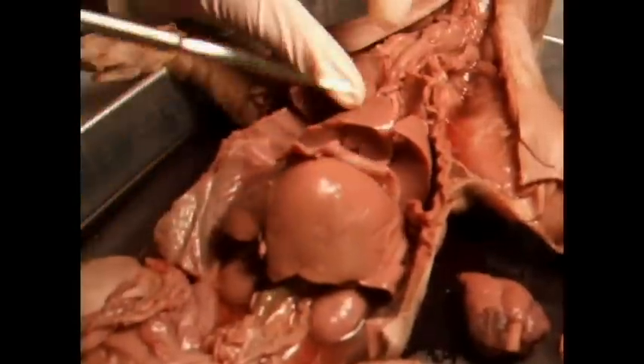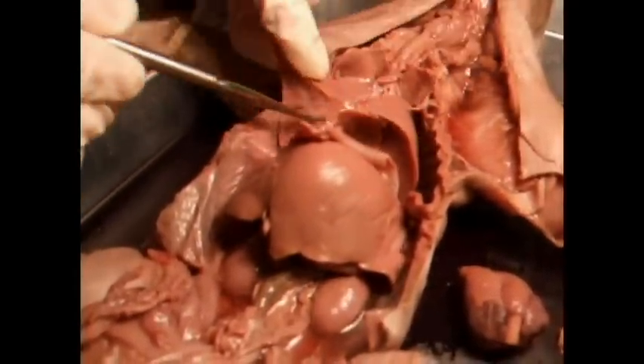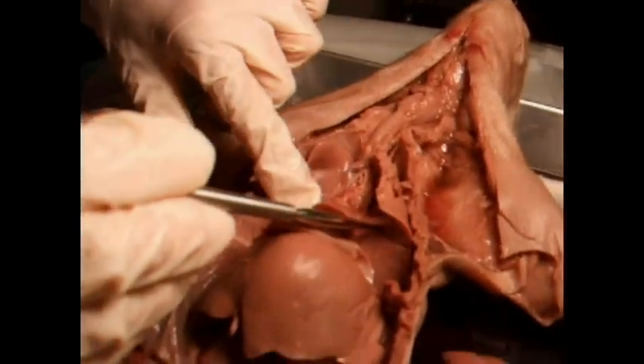Here you have the right lung, and if you notice, if you count the lobes, there'll be a different number of lobes. And this is the left lung. This is what helps supply oxygen to your blood.